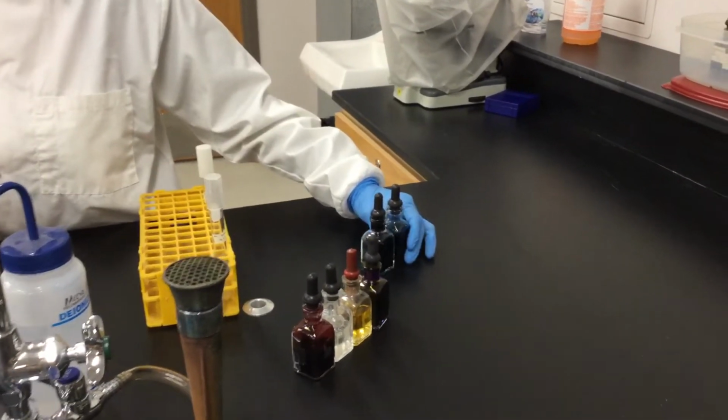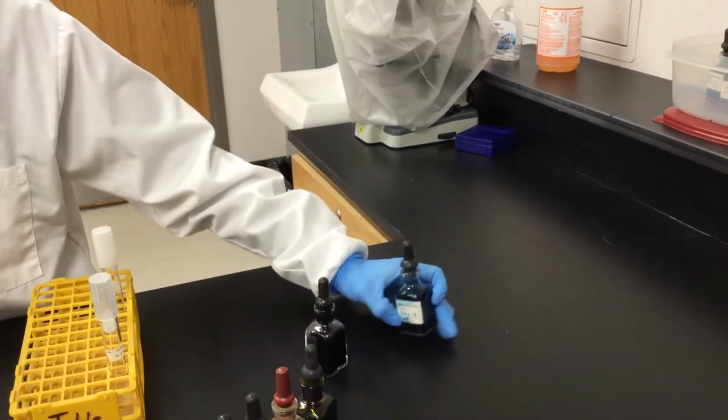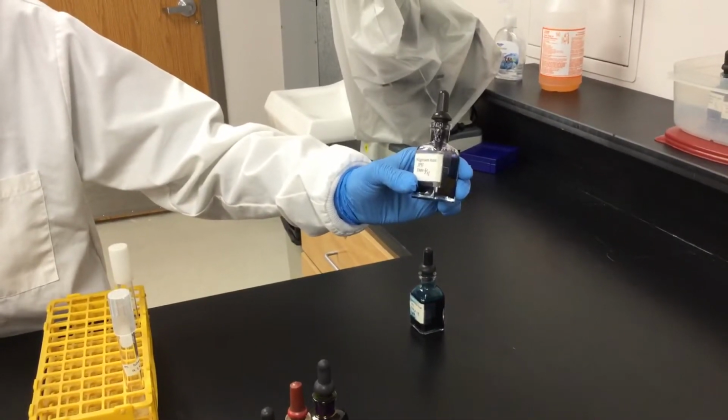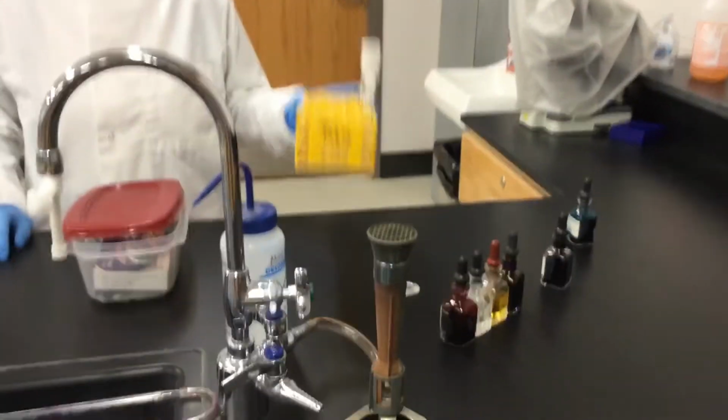And then we're going to do also simple staining, which includes methylene blue. And we're going to do something that's called negative stain, which is nigrosin. And you will have your cultures in a rack.